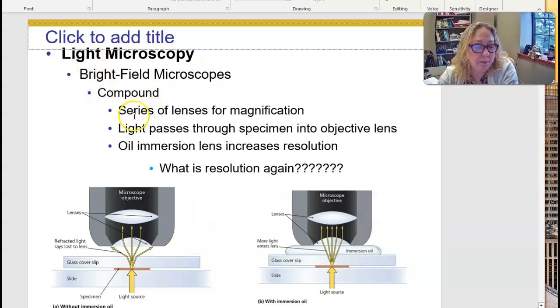The light microscope, there's a series, right? You're always going to start on 10 and then go up to 100. And then at some point you're like, I still do not know what this is. I cannot see it. So what you're going to do is use some immersion oil. Yeah, you are. You're not going to want to because it makes a mess and it's hard, but you're going to end up having to do it.